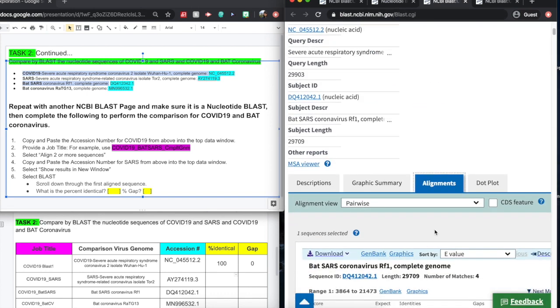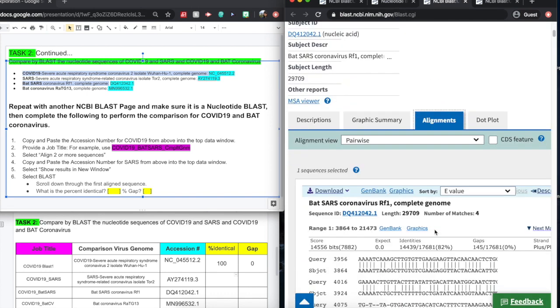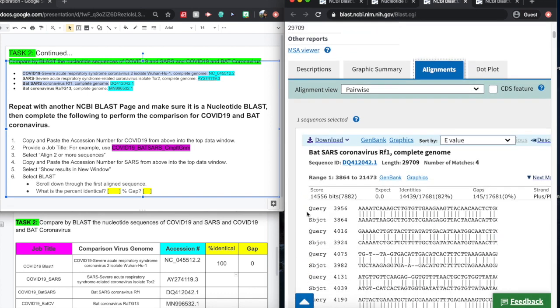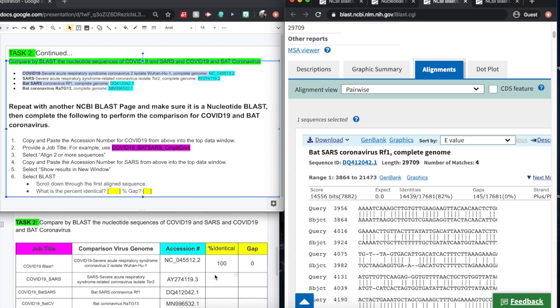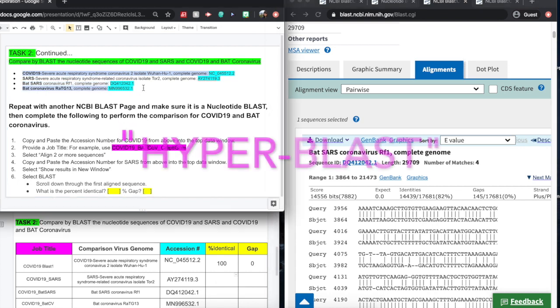Get aligned. Again, you can see the two sequences set up side by side. And we have our percentages and our gap percentage. We can gather and import that data into our data collection sheet once again.